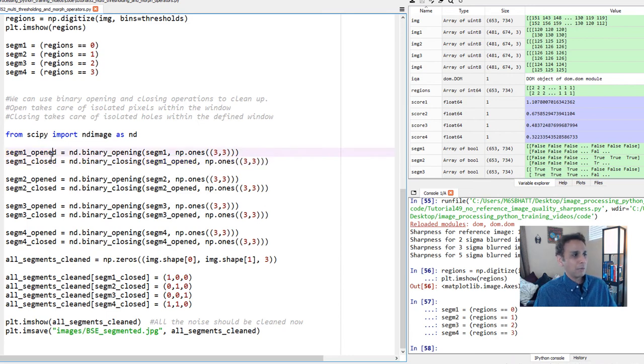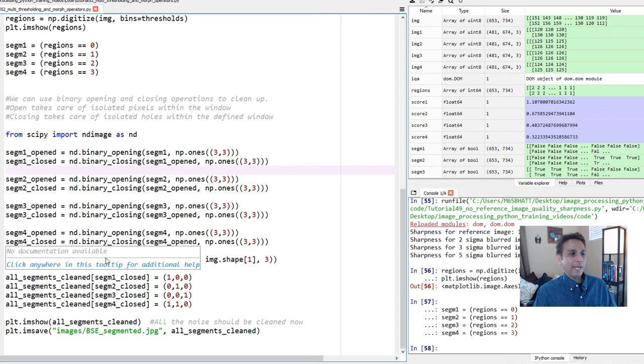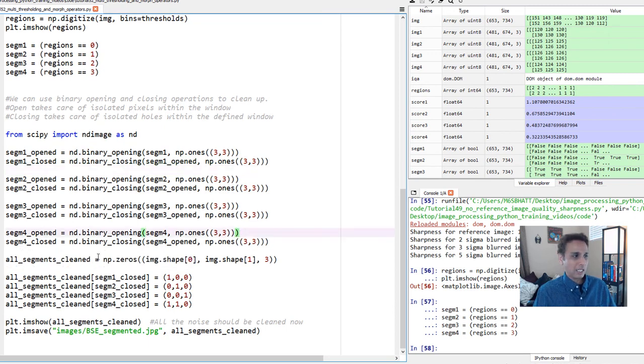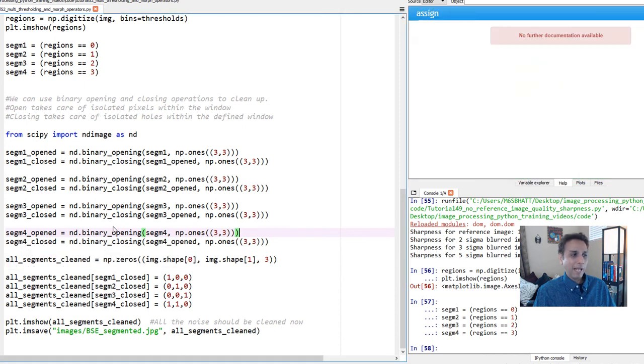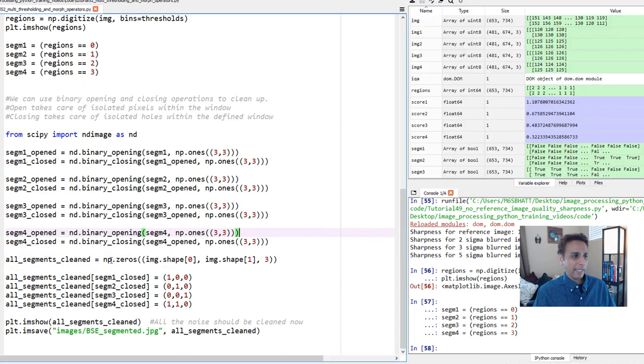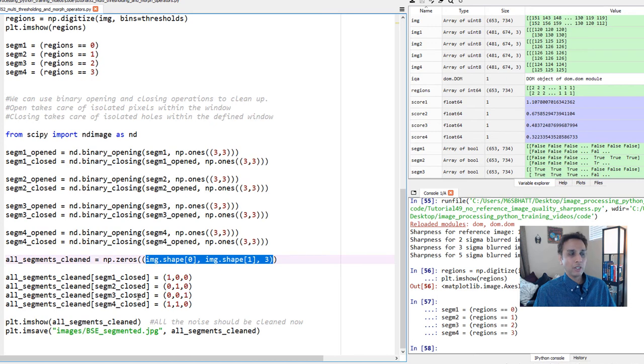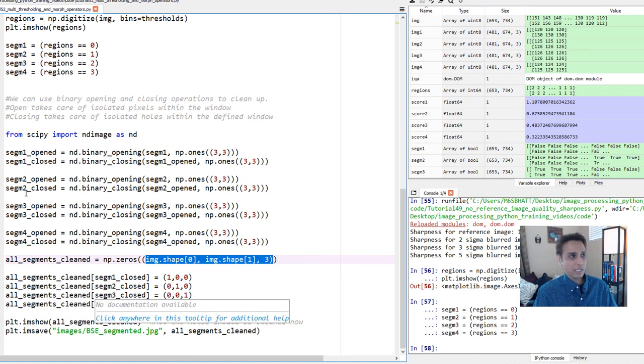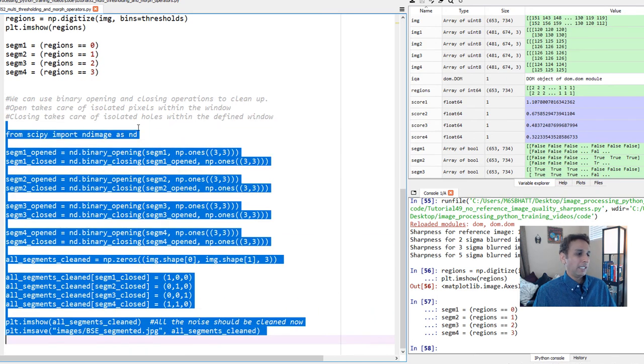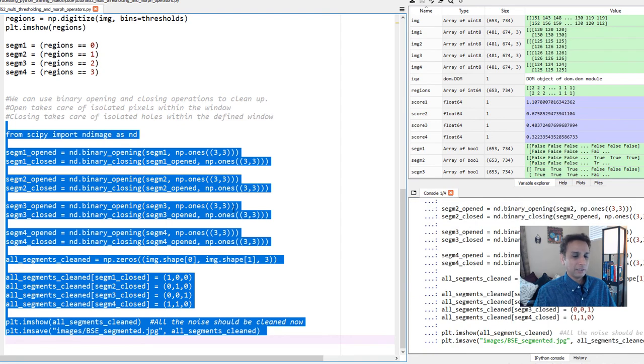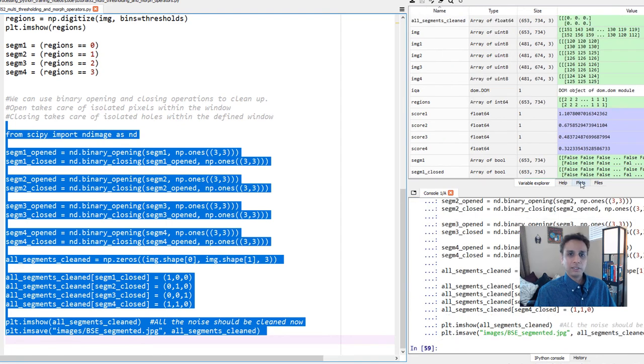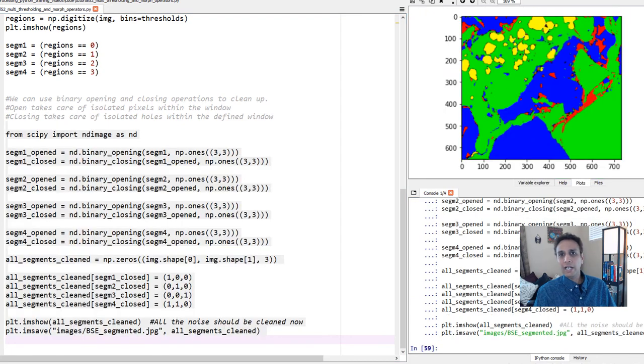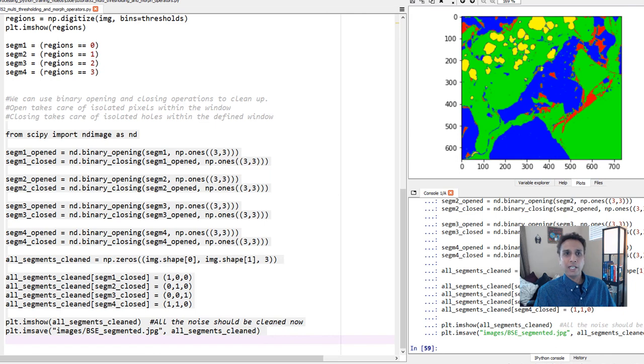Then I did exactly the same that I did in the last tutorial, which is create a blank array with all zeros, with the shape of our input image and three channels, and merge all the channels so it looks good for visualization purposes. Let's run this and then visualize it.